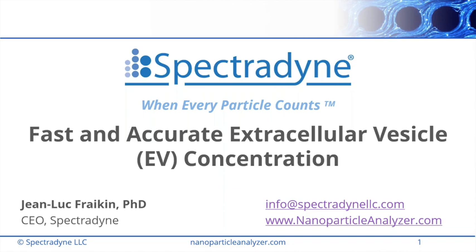If you want to make that a traceable measurement, it gets a little bit more complicated, because you'll need to know how the resolution is changing at your limit of detection, how confident you are that 70 nanometers is 70 nanometers, or whether it's 70 nanometers plus or minus 5 nanometers. So with that, you need to run some more controls. But I think as a step forward for the field, just stating the detected concentration above a limit of detection is definitely a step forward, and has been shown for us to be very reproducible without the traceable measurements within the lab.